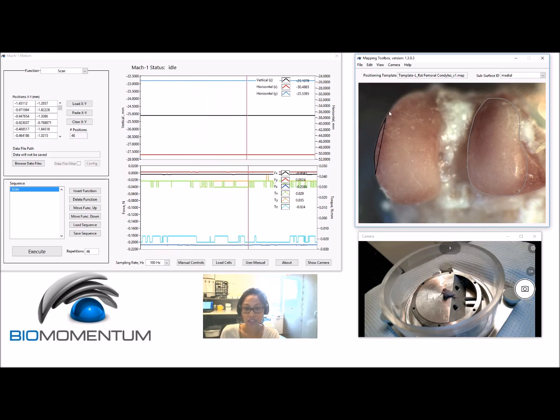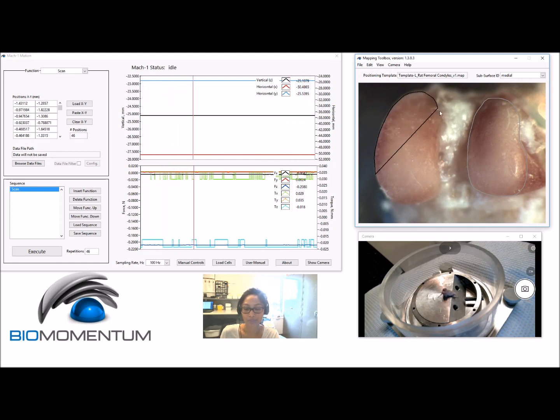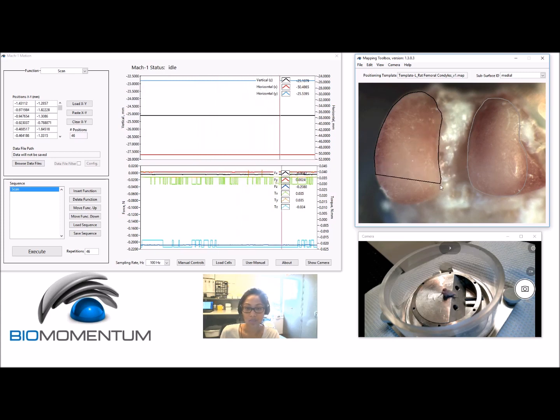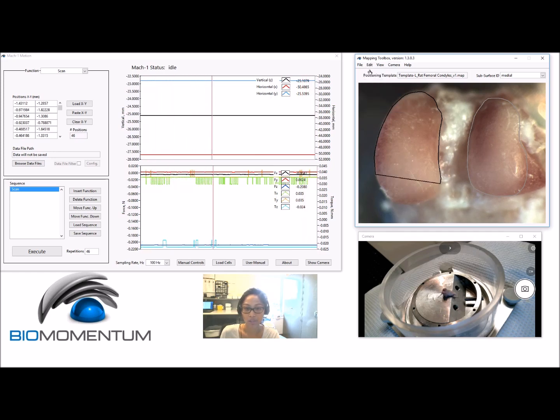Choose Add Boundary and click in the camera feed to define the boundary along the appropriate subsurface. You can also choose Delete Boundary and click in the camera feed at a boundary point to correct any misshape of the subsurface boundary.